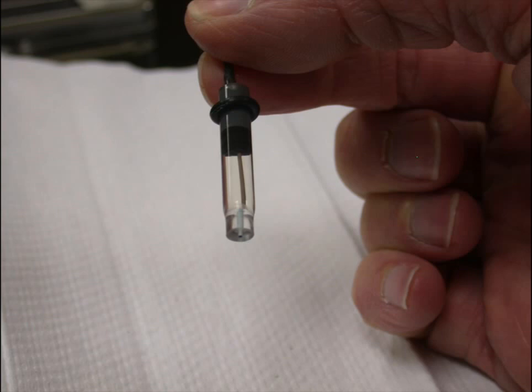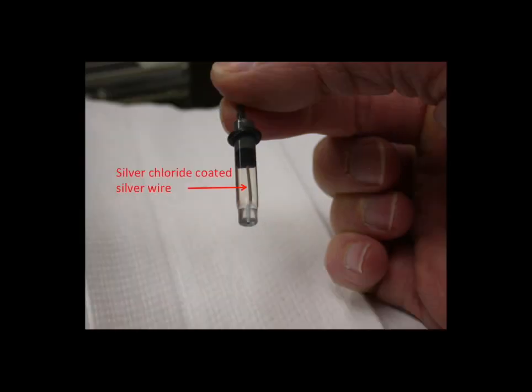Here is a more practical reference reaction based on the reduction of silver chloride to metallic silver. Both the oxidized and reduced forms are there at the wire surface. Since chloride is a product, it shows up in the Nernst equation for this half-cell.